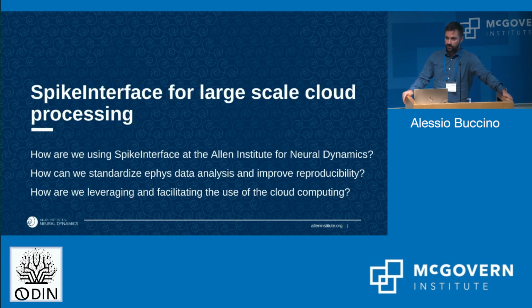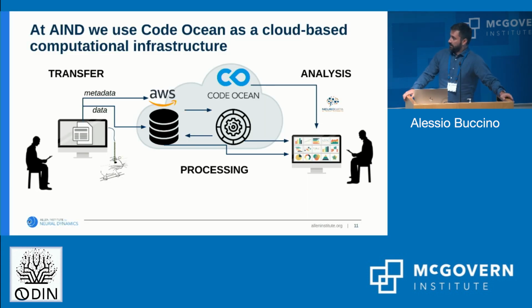So in the second part of this talk, I want to talk about some recent features that we added to SpikeInterface to make it cloud-friendly, because at the Allen Institute for Neural Dynamics, we're basically moving all the processing to the cloud. This is what we are doing.